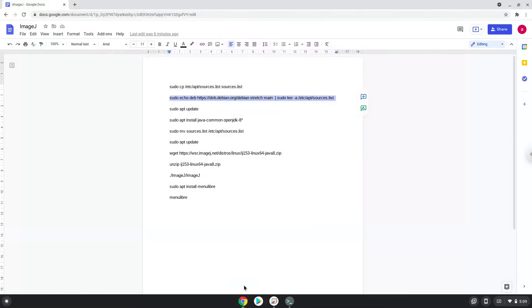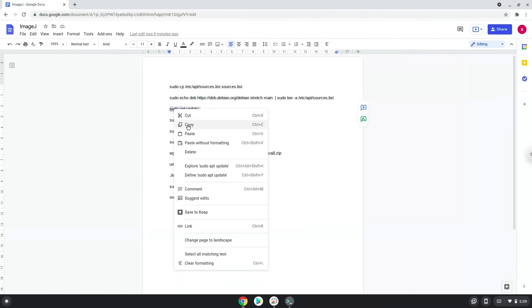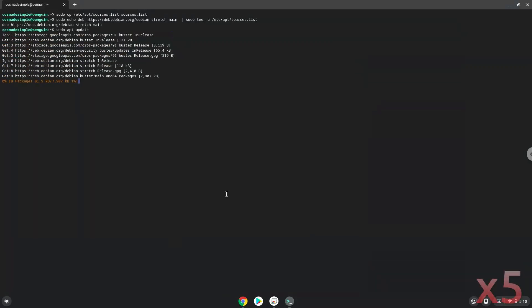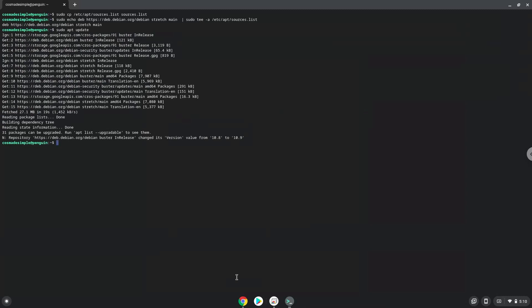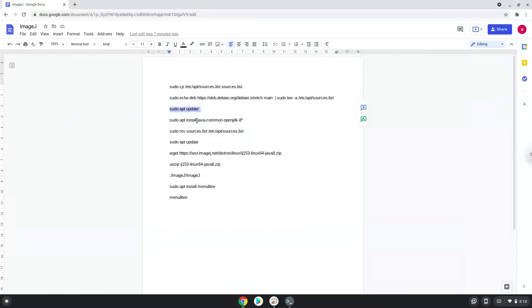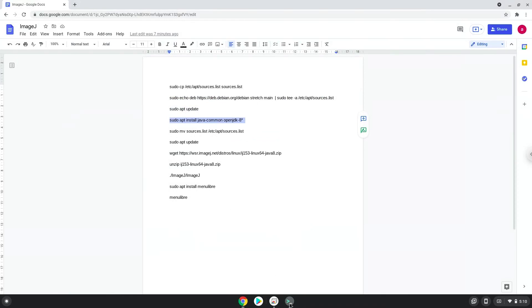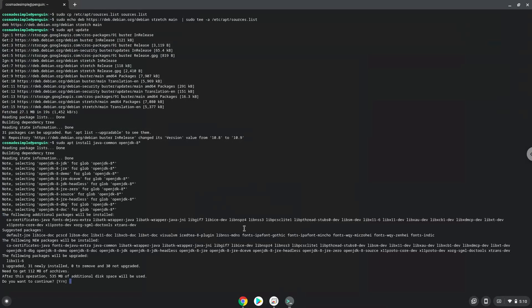Now we will update our Linux system repositories. Now we will install Java 8 and press enter to confirm the installation.